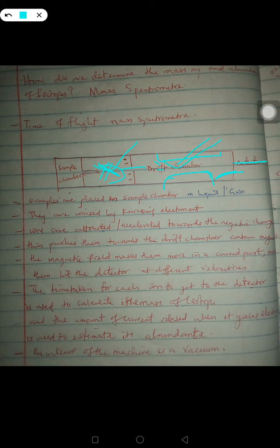Now, why did they move at different speeds in the same chamber? Because they are not accelerated. They were accelerated in this chamber, remember? But here they were not accelerated by anything. So they move at their own regular, different speeds.